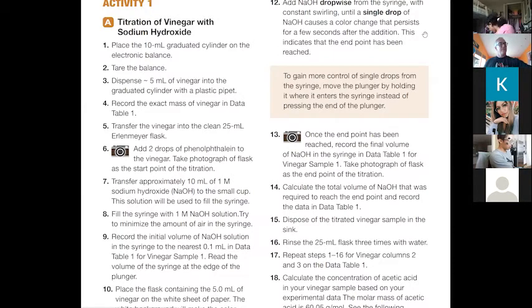So that's why titrations are still used all the time in industry and everything, but we don't have people doing them. We have robots doing them, and they can add microliters or even nanoliters of titrant at a time and monitor the color of the solution much more accurately than we can. So they get extremely accurate profiles and can calculate the pKa down to 4 significant digits.